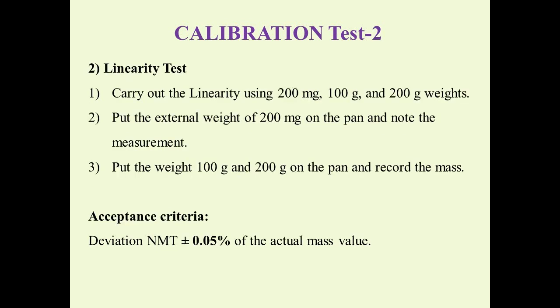Linearity testing verifies the accuracy of the instrument at intermediate values of weight. Manufacturers often use the term accuracy in advertised specifications. This test is quite different from linearity testing in the clinical laboratory. The balance linearity test measures the ability of the balance to accurately measure an added weight before and after a non-measured weight load has been placed on the balance.